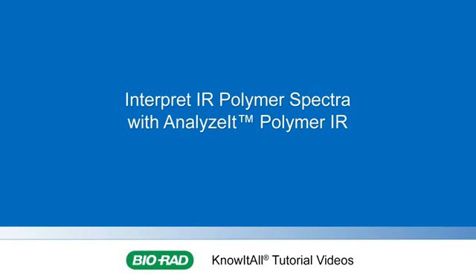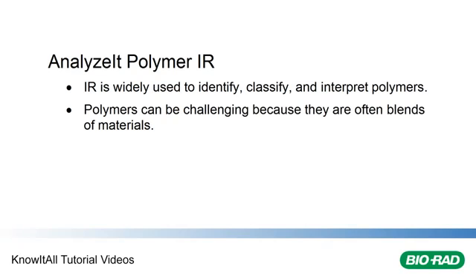Welcome to a demonstration of how to use the KnowItAll Informatics System's AnalyzeIt Polymer IR application. IR spectroscopy is widely used to identify, classify, and interpret polymers. However, because commercial polymers are often blends of materials, they are often challenging materials to identify.